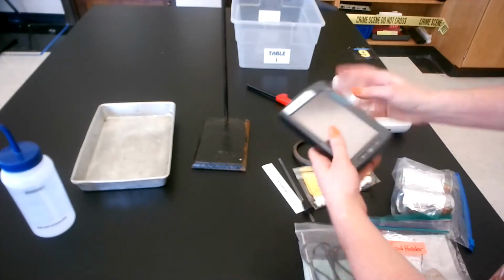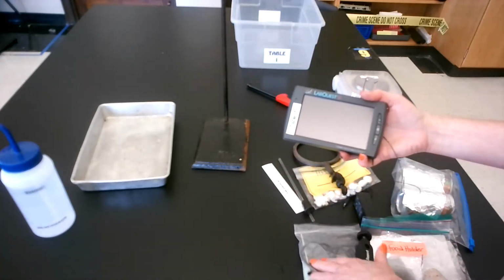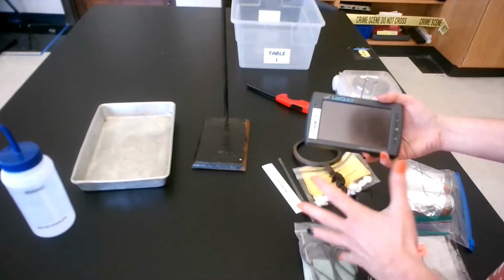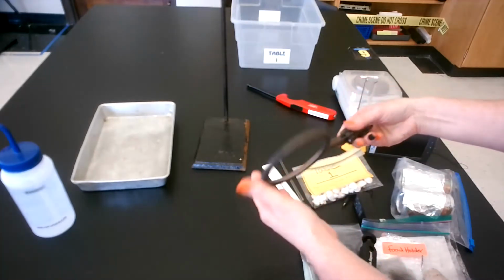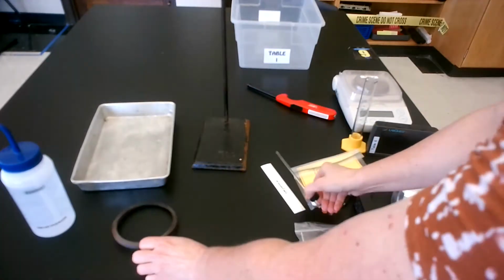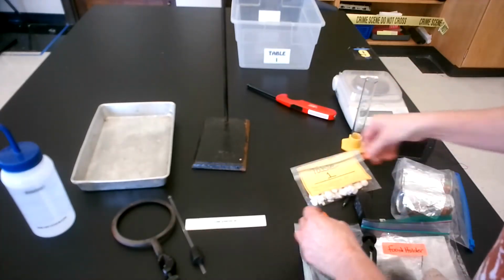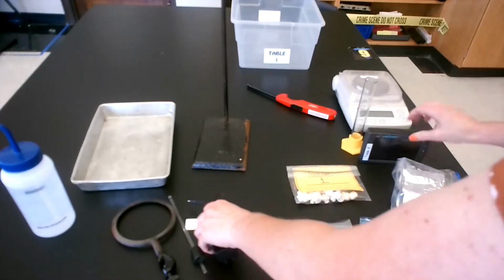Then we have a LabQuest. This is an interface that is going to read the temperature on the probe, so it'll be displayed. There are other features that you can use, but we're just going to focus on hooking it up, getting it turned on, and then reading. So that is the LabQuest. This is a ring that's going to go on the ring stand to hold our can. We're going to have a glass stirring rod with a rubber stopper, just to act like a little handle, a 6-inch ruler, and then a power supply to go with our LabQuest.